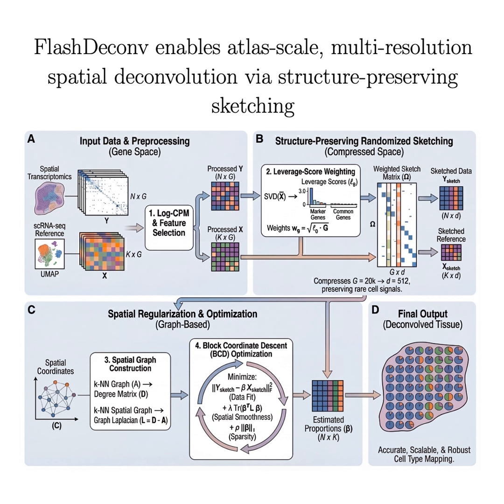Beyond the speed, what real biological discoveries were made possible by its ability to resolve these rare cell signals at high resolution? Okay, let's start with a clinical application. Human ovarian cancer. The researchers looked at 6 patients, and they were stratified by how well they responded to treatment. And the rapid turnaround let them do what? Validate biomarkers almost instantly. Instantly. The entire cohort, all 6 patients, the analysis took 3.8 seconds.